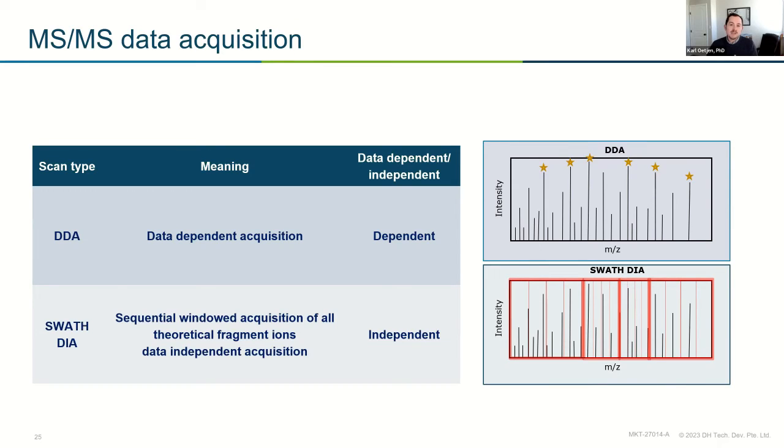Are you using a piece of information to conduct an MSMS experiment, or are you using no information? Within there are obviously nuances. I'll just speak to the SCIEX perspective of what we do, but those are the two buckets that MSMS data falls into when acquiring in this kind of fashion.